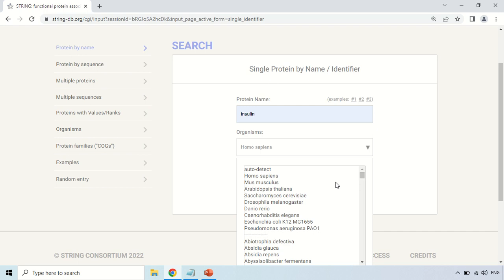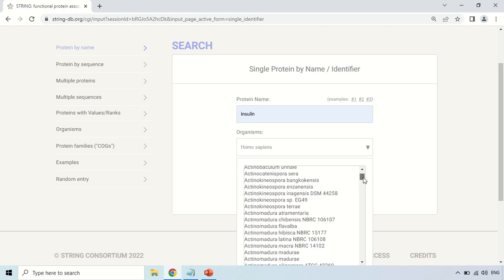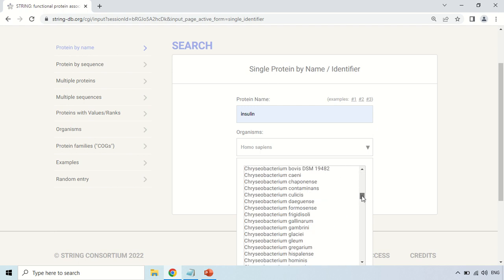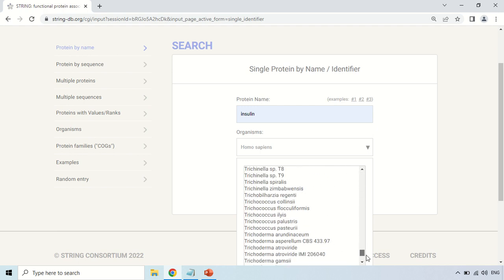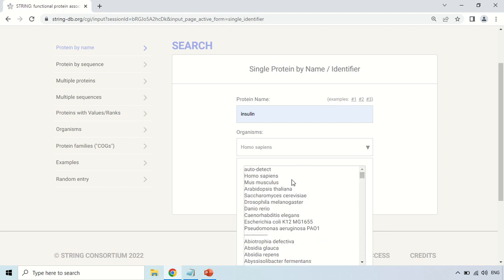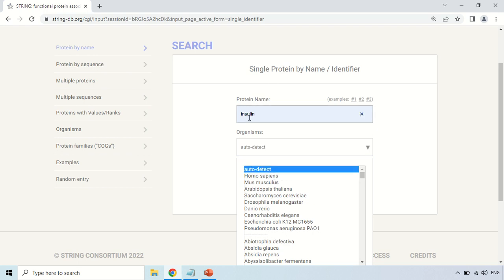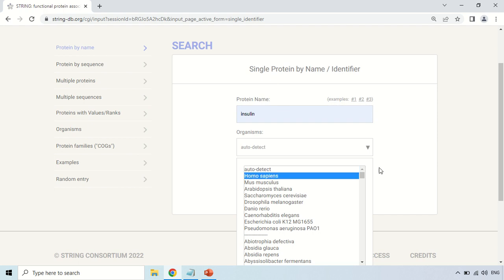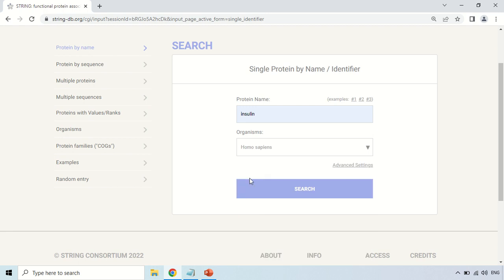Now the organism list appears, including Homo sapiens, mouse, and so on. You can scroll down and see that there is a huge list of organisms available. You can choose your organism according to your need, but this time I am choosing Homo sapiens because I want to perform the protein interaction of insulin present in Homo sapiens. Alternatively, you can use the auto-detect option, which will automatically detect which organism the protein is available in.